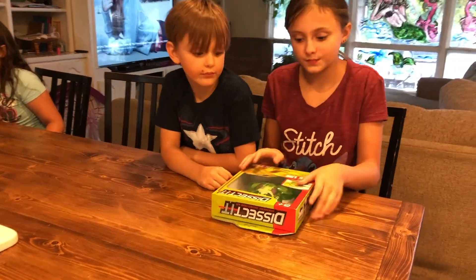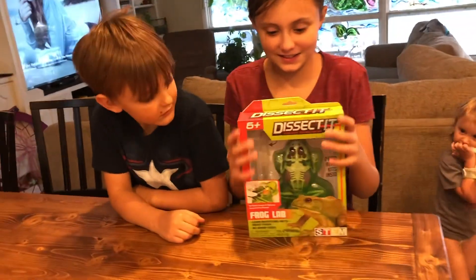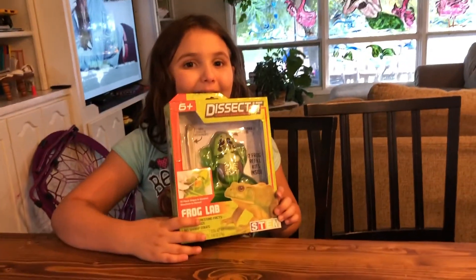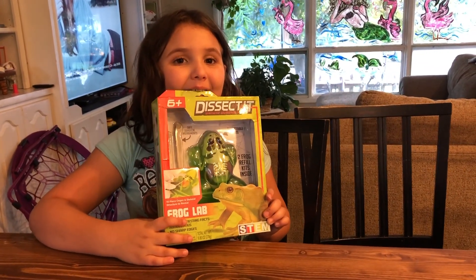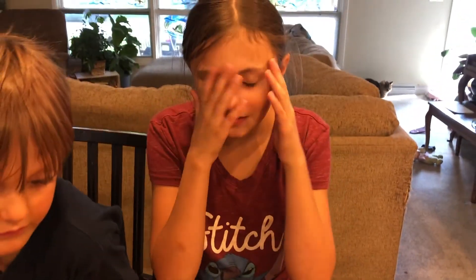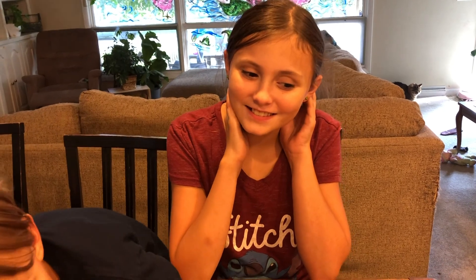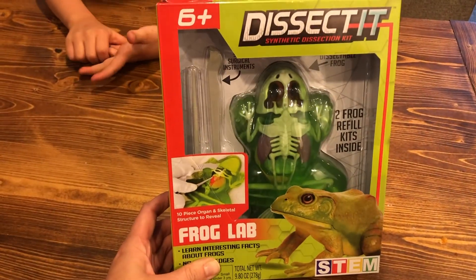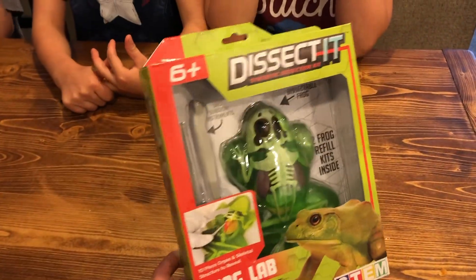Hey guys, you want to show me what we're going to do today? Dissect frogs! We got these online from Target. Super cool. We wanted to dissect frogs because what are we learning about, Zoe? Frogs and ponds and aquatic biomes — fresh water biomes specifically. I didn't really want to do real frogs so we're going to try these guys out.